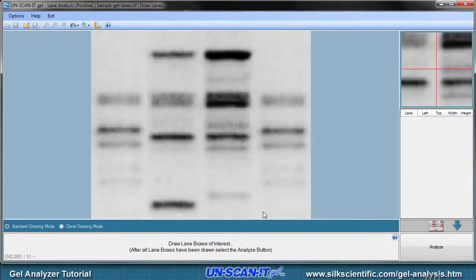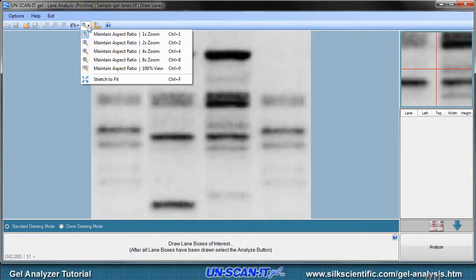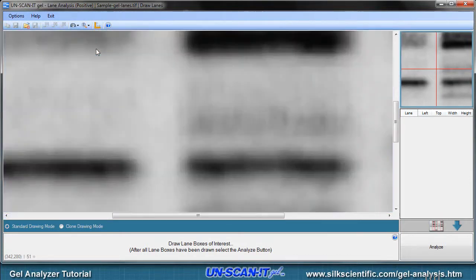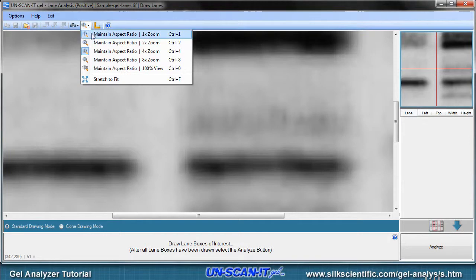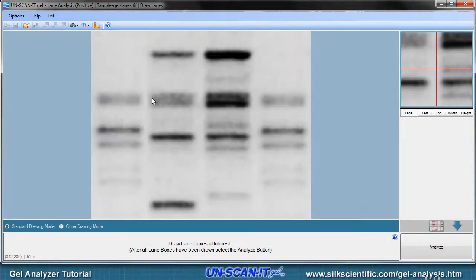The next screen is where you will draw the lane or segment boxes of interest on your gel image. General instructions will be presented at the bottom of the screen. You can use the zoom toolbar option to increase or decrease the zoom level of the main image. Simply use your mouse to draw or drag the box at the desired location on the gel. Since we are using lane analysis mode, we will draw a lane box that encompasses the entire first lane.